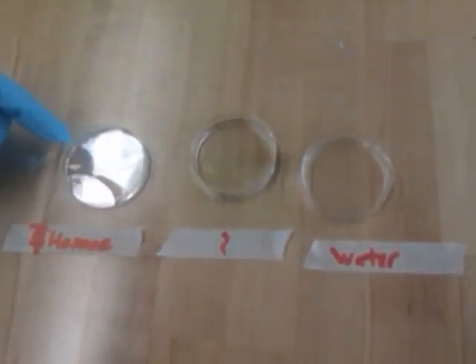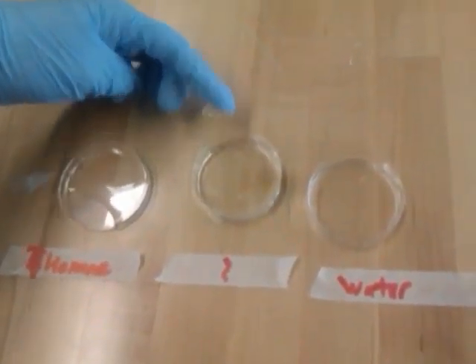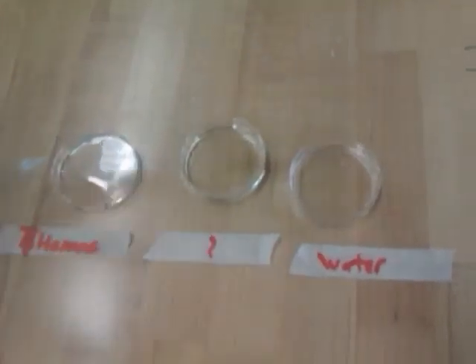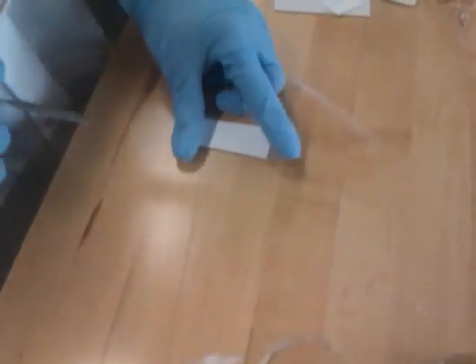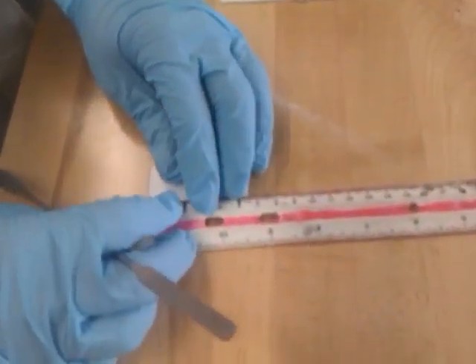So here we have three solutions: hexane, unknown, and water. And to find out what the unknown is, we will use thin layer chromatography. So let's set up our plate.